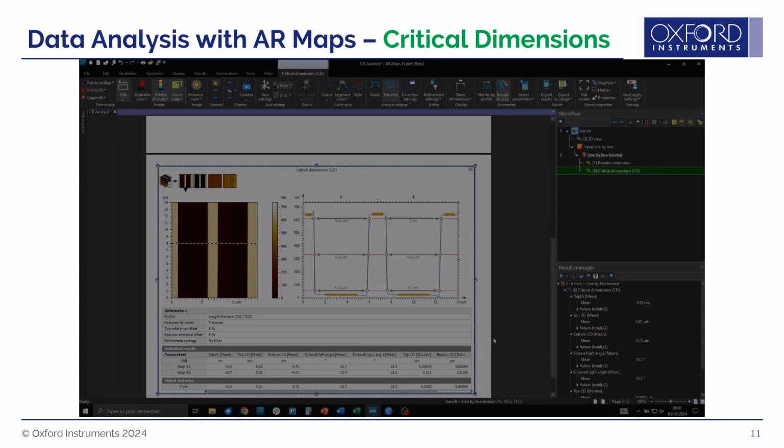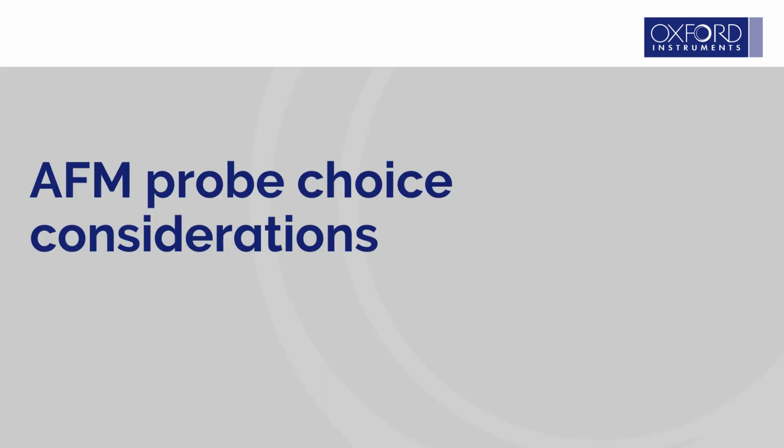As I said, you'll see more of AR maps in MARTA's presentation. The last thing I want to discuss before handing things over to MARTA is to introduce the concept of tip-induced artifacts in AFM measurements and how important it is to consider how AFM probe choice can affect your measurements.